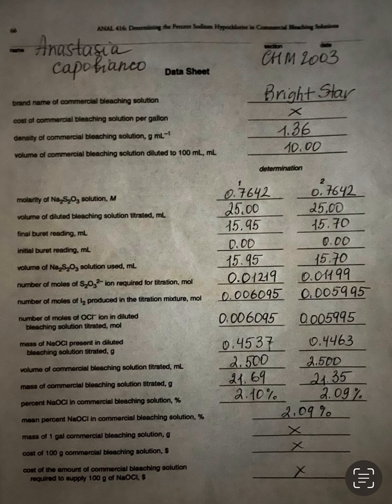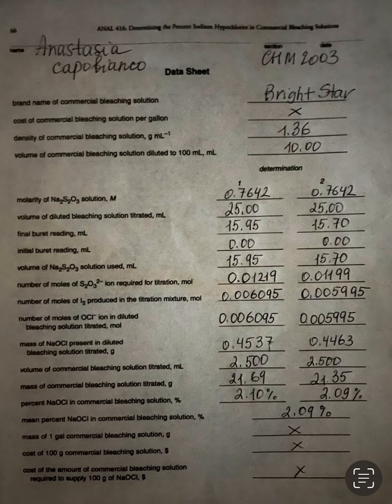By using stoichiometry and the formula from equation number 3, right? We can find, this is actually, no, equation number 3 is for finding the volume of sodium thiosulfate ions.